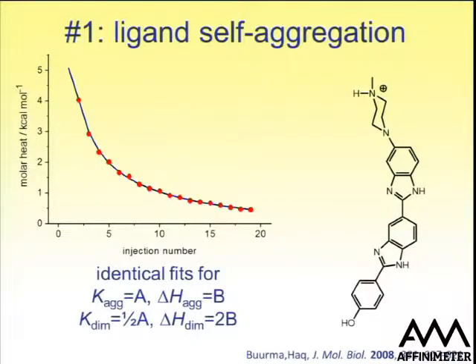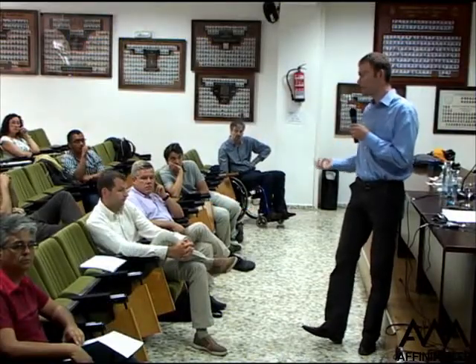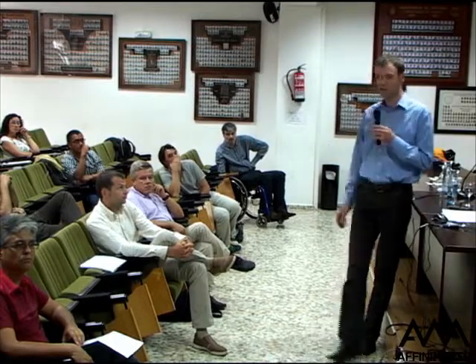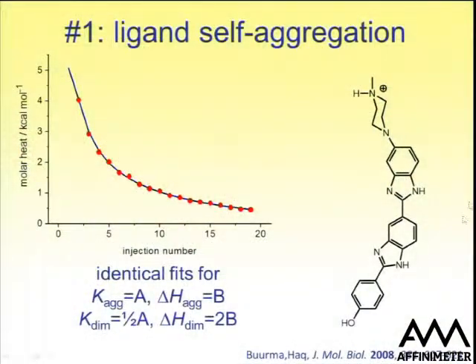If ever you need a technique, or if you want to develop a technique that identifies whether something is a groove binder or an intercalator, you'll use this molecule as your test molecule because everyone knows it's a groove binder. The problem with carrying out ITC experiments with this compound is that if you look at the heat effect of dilution, this is non-constant. And what that tells you is that this particular molecule is aggregating.